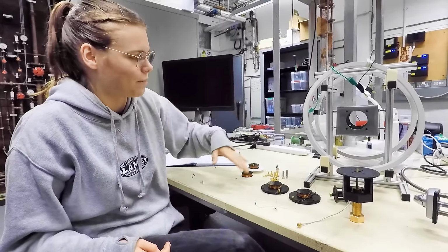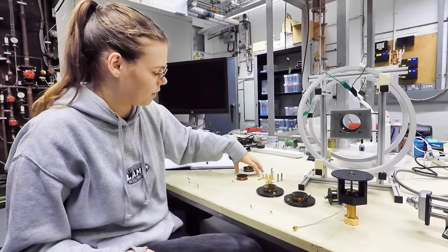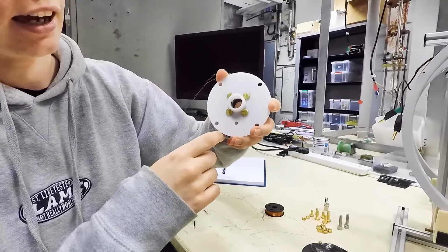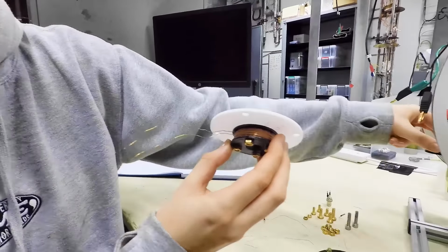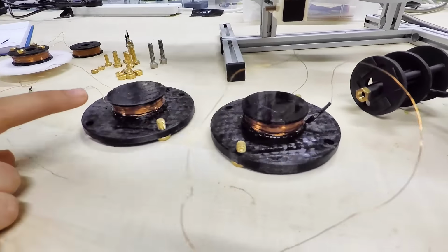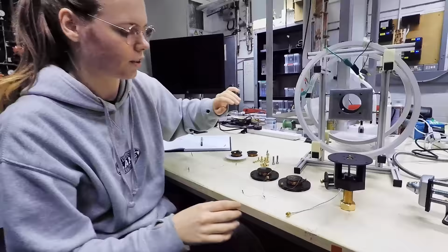Okay, so the components that go in this cavity, first we've got modulation coils. There's this one which sits on the top and also holds the sample, and then has the modulation coil, and that's the matching one that would go at the bottom of the cavity. And then we also have these two, which you can put on the sides, so you can change the setup to match the outside coils.